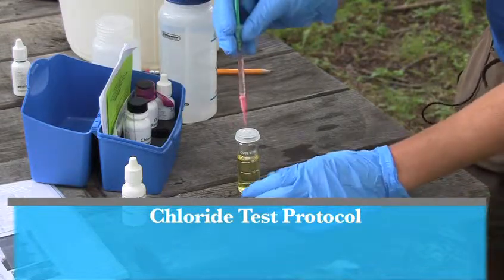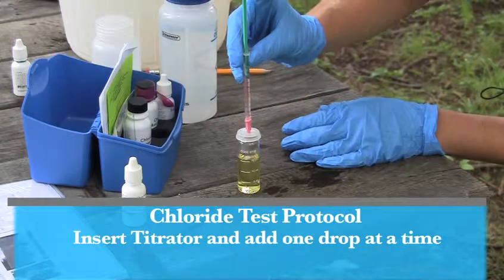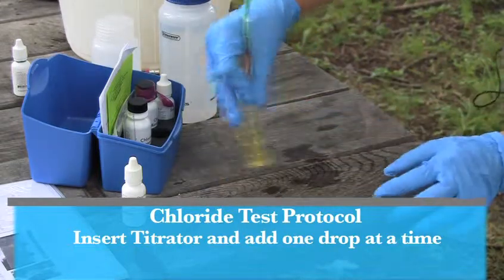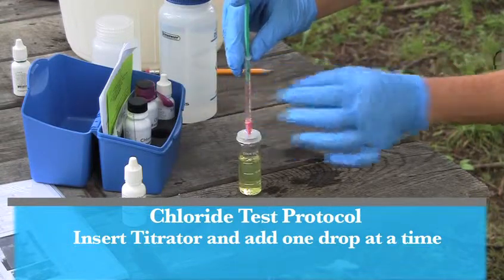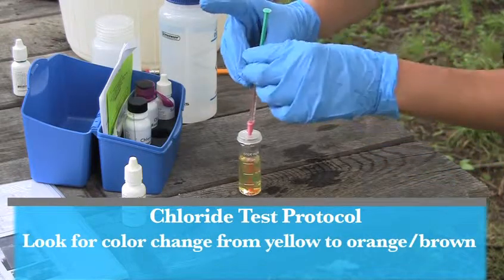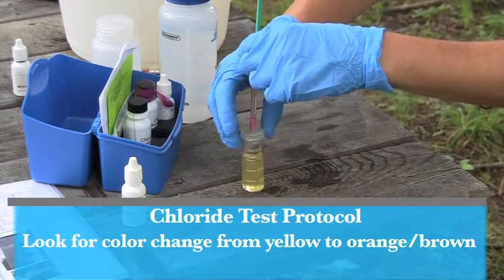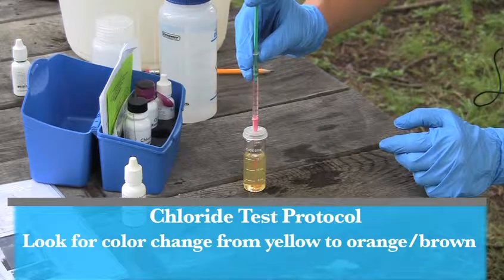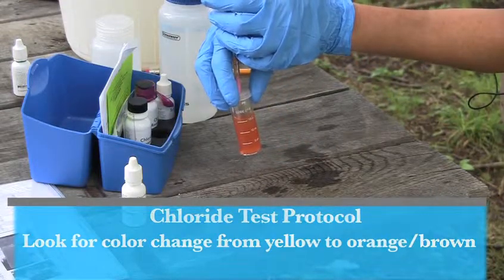You're now ready to titrate the sample. To do this, insert the titrator tube into the cap hole and add three drops at a time, and swirl and mix. It's really important that you swirl every time you titrate to ensure that you don't over-titrate the sample. What you're looking for is a color change from yellow to a brown-orange that's consistent throughout the sample. Sometimes a white background can help determine the color change as well. And there we have the color change.